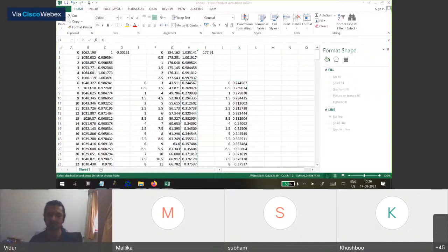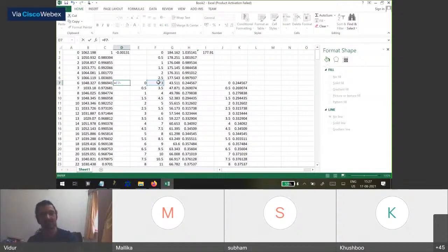Can you just repeat this time calculation? Oh, yes. So once you have this time series, you just put the equation, which is equal to your time cell minus whatever value is in your first post-bleach frame. So in our case, the first post-bleach frame has a value of 3. So you just put 3, and then you iterate it over all time values.